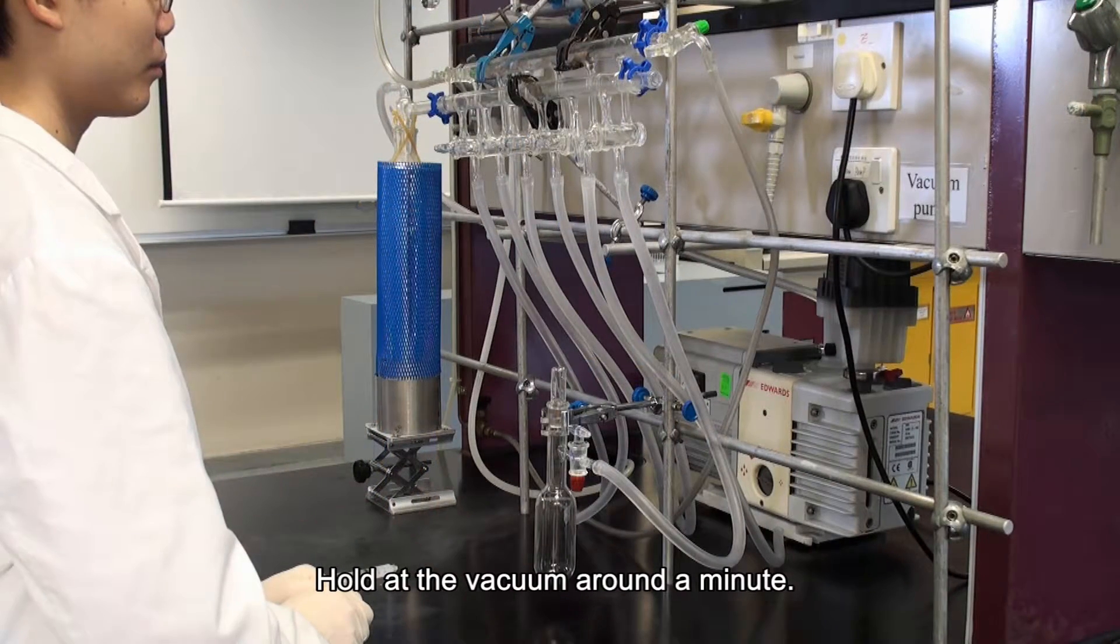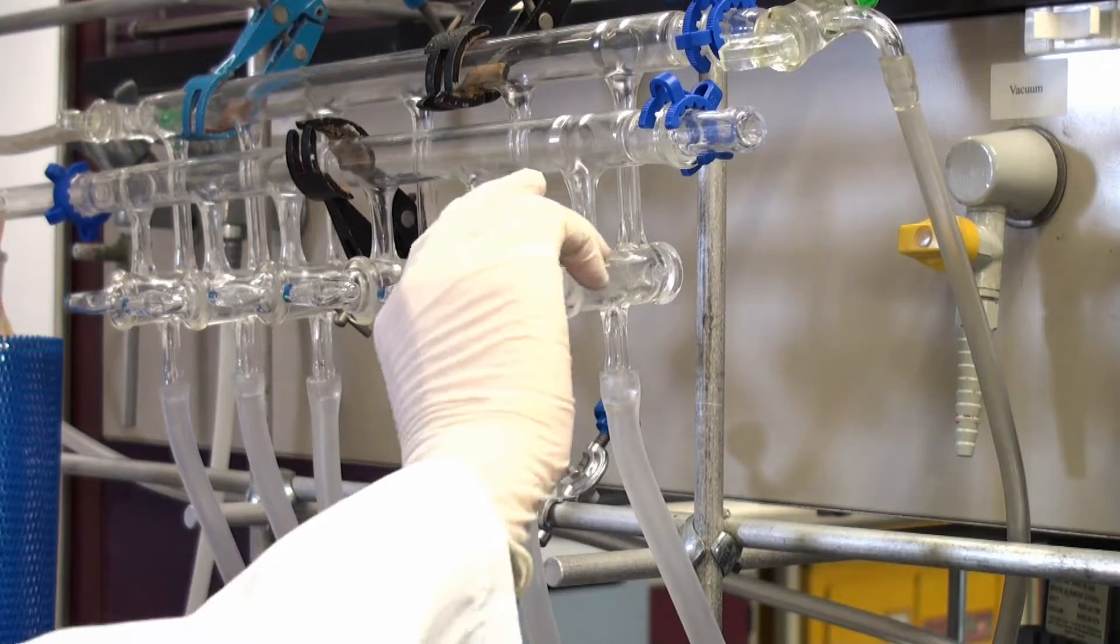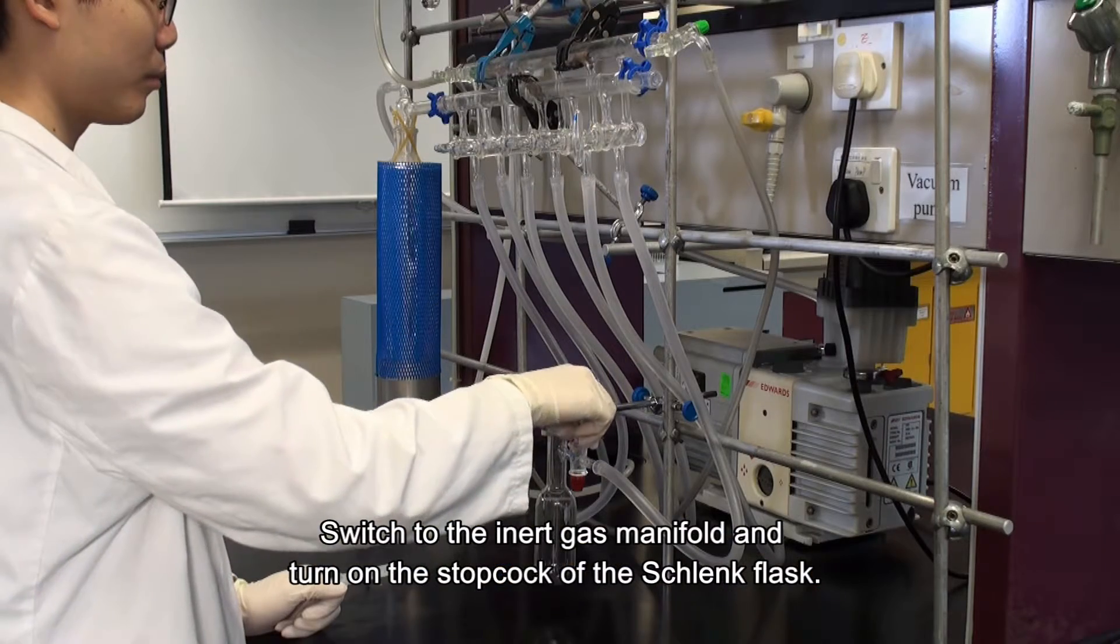Hold at the vacuum around a minute. Close the stopcock of the Schlenk flask. Switch to the inert gas manifold and turn on the stopcock of the Schlenk flask.